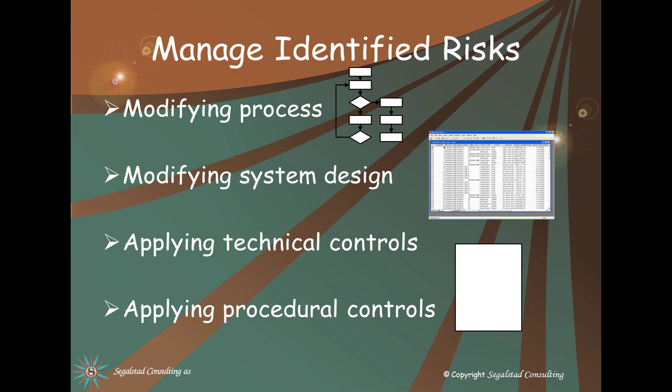And finally, the last resort is the procedural controls. This is if it's not possible to make technical changes to the process, system, or technical control, the procedures or standard operating procedures can tell what is allowed and what is not allowed. The problem with the procedures is that people may follow them or not.